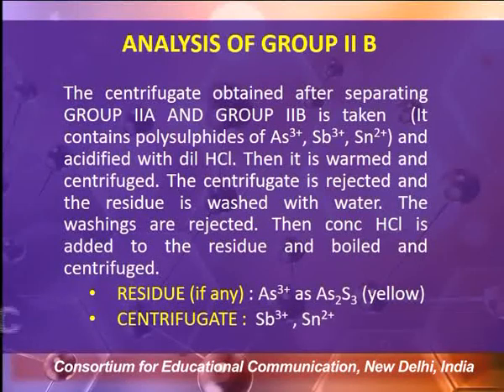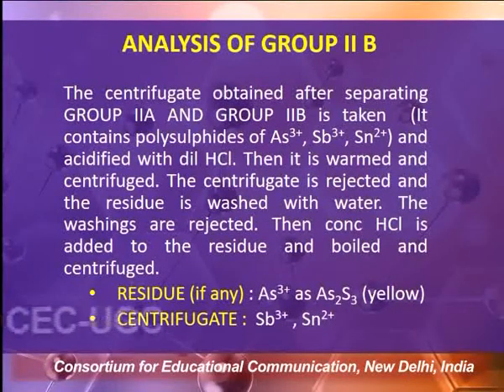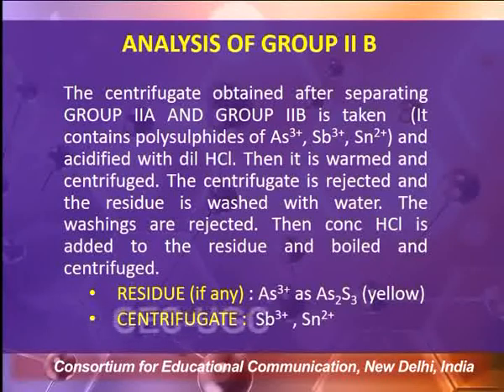Then it is warmed and centrifuged. The centrifugate is rejected and the residue is washed with water. The washings are then rejected. Then concentrated HCl is added to the residue and boiled and further centrifuged.